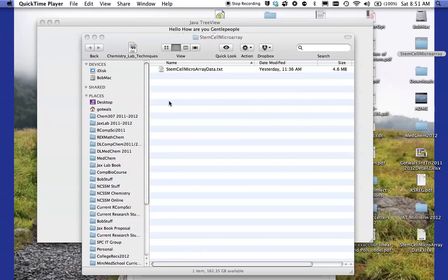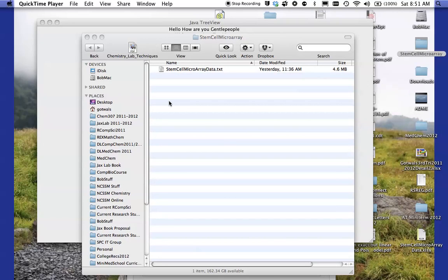Hello, this is a podcast on how to use two pieces of software. The first one is Cluster. The second one is Java TreeView to filter and analyze microarray data in computational biology.